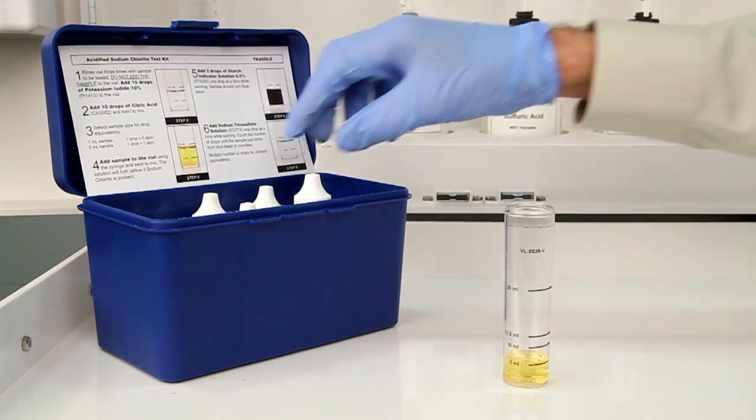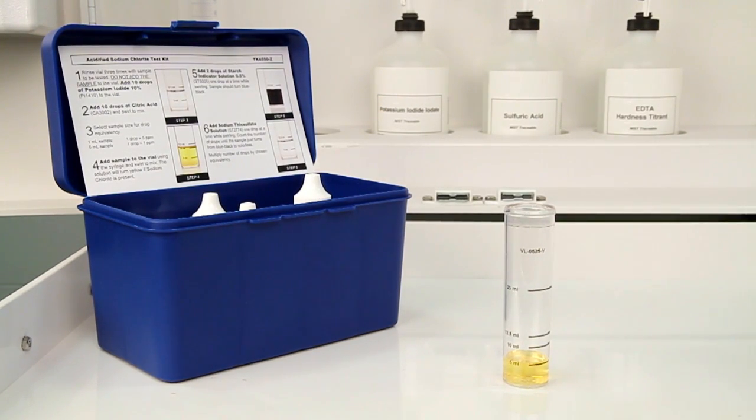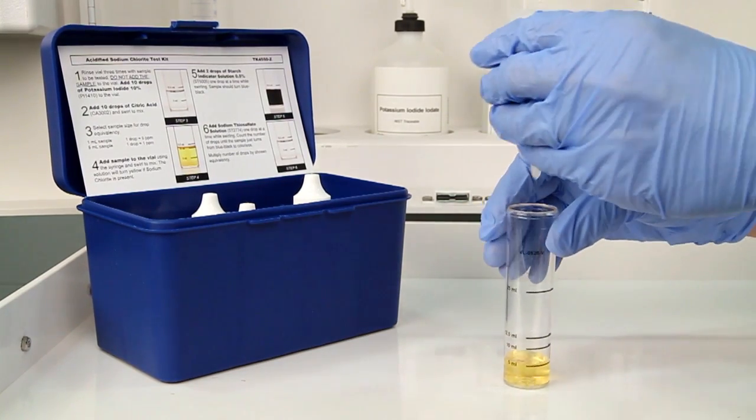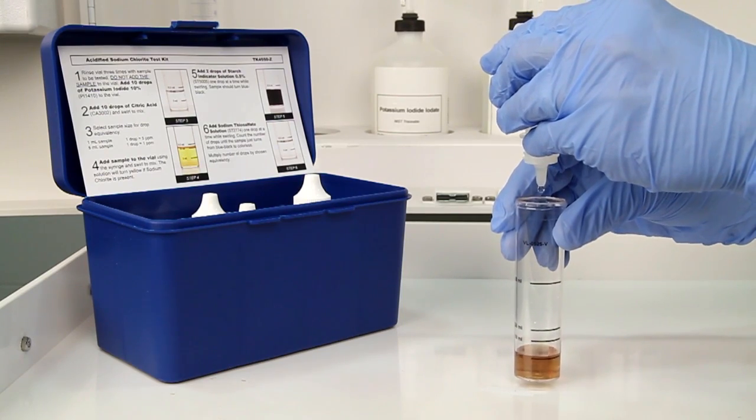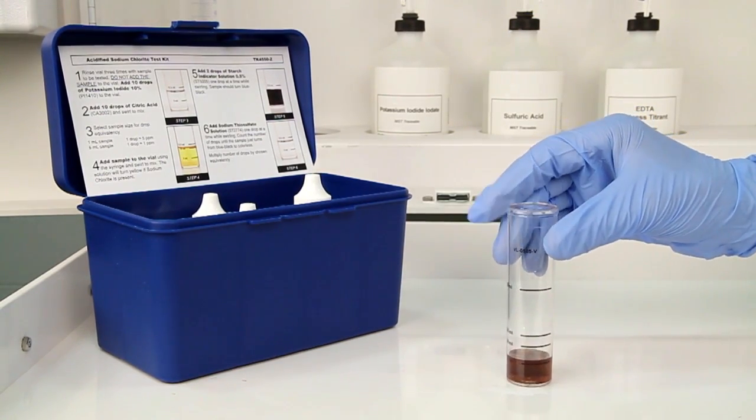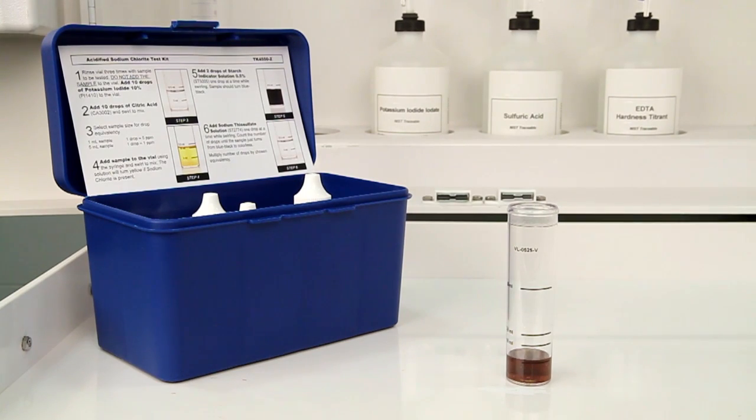The next step is to add 2 drops of starch indicator solution 0.5%. The bottle contains a dropper tip, so it's important to hold the bottle vertically to get a consistent drop size. After the addition of each reagent, swirl the vial to make sure the reagents are properly mixed. The sample should turn a blue-black color.